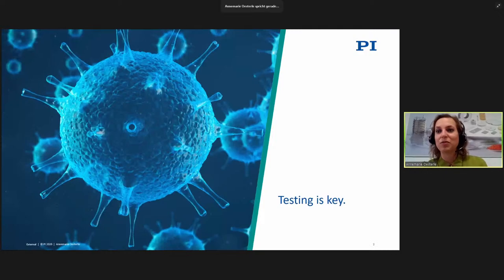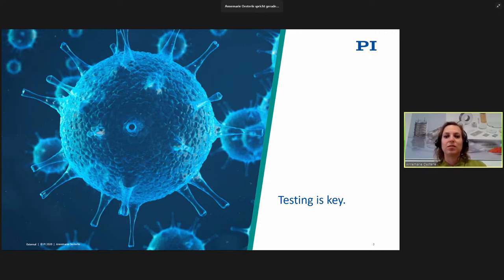So yeah, as all the previous speakers have already said, COVID-19 has of course a big influence on all the business around microfluidics and in vitro diagnostics. Of course, we know there is a huge demand for microfluidic devices and in vitro diagnostics for testing of COVID-19. But as the first speaker, Mr. Becker, has already shown, there was a lot of interest in in vitro diagnostics and microfluidics also before COVID-19. And I think we can all be sure that this will continue on a quite high level also with some distance to this pandemic. So I want to speak about the application and the enabling function of piezo technology for microfluidics, which is included in most or can be included in many in vitro diagnostic devices and technologies.